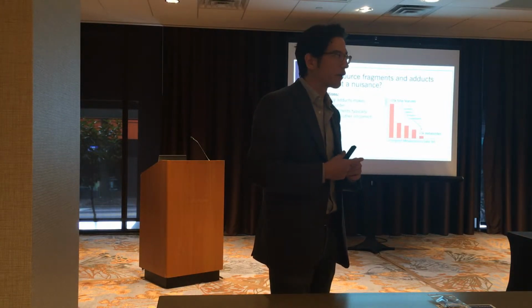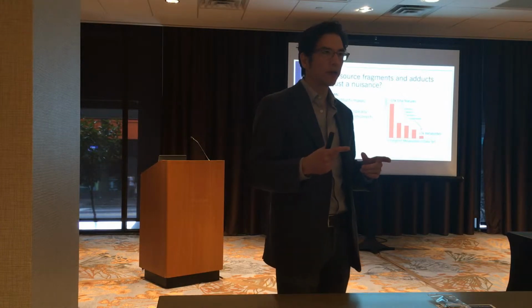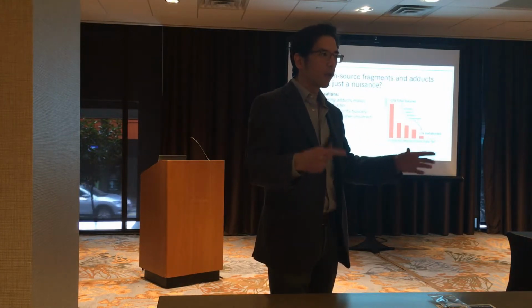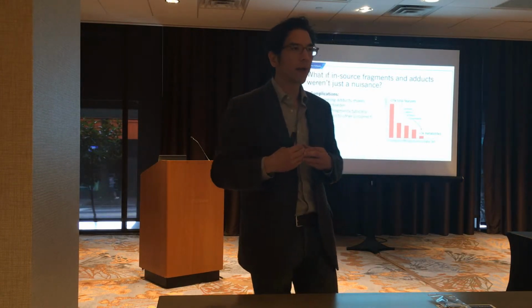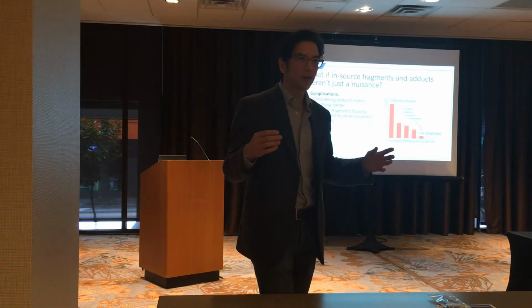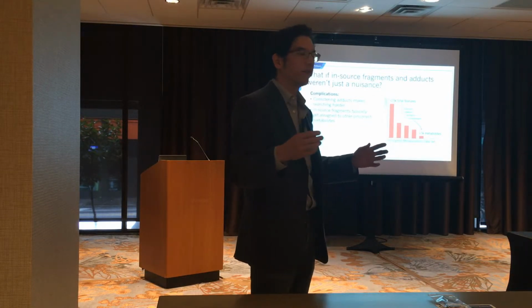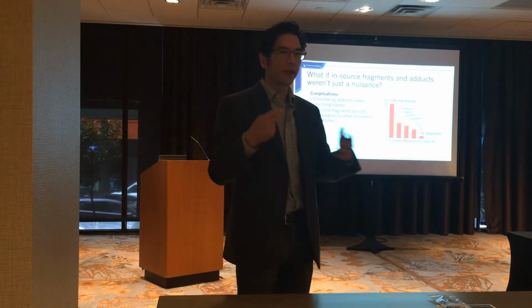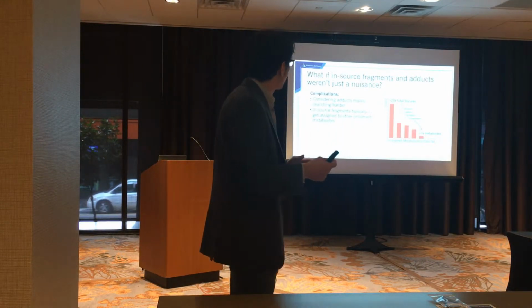So it's as if you're searching for PTMs in the proteomic search space. Every extra PTM you search for, the worse your overall search results are because your search space is that much larger. And so your false discovery correction needs to be more aggressive to be able to balance out the extra potential metabolites you could be finding.